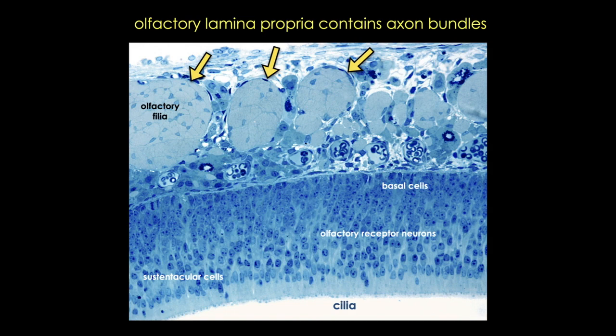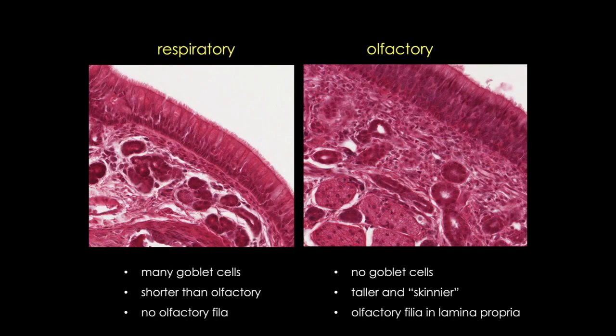Now let's review the differences. In these two images, I hope that you can now appreciate the many goblet cells of the respiratory epithelium, the taller appearance of the olfactory epithelium. And remember to look for those axon bundles or filia in the lamina propria of olfactory mucosa. I hope that these tips will help you solve this case of mistaken identity. Thanks for stopping by.